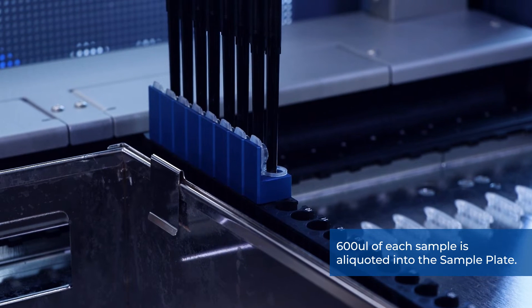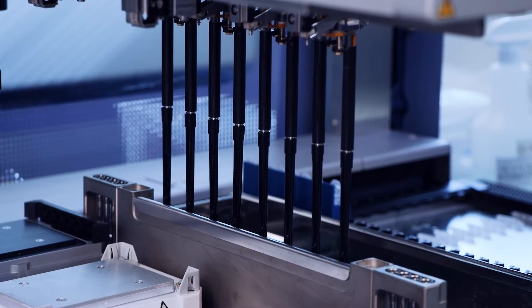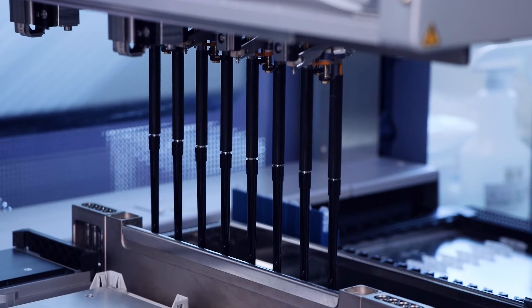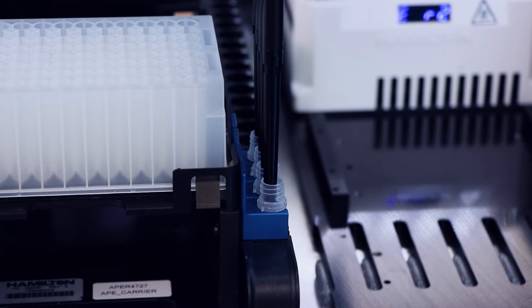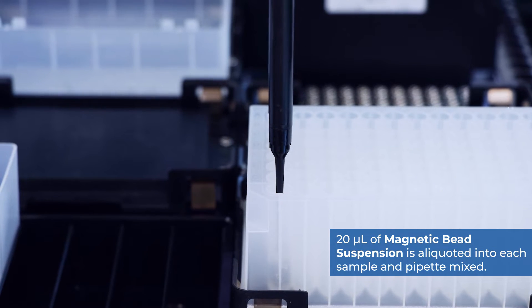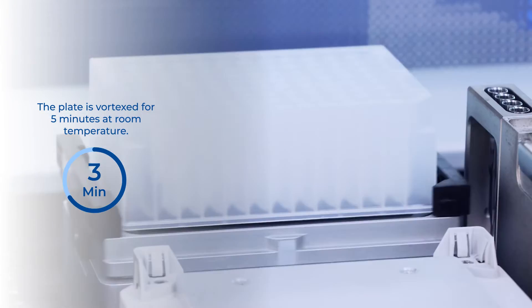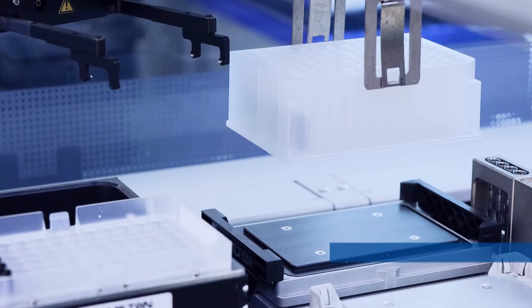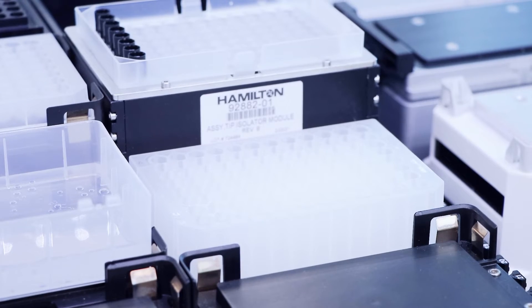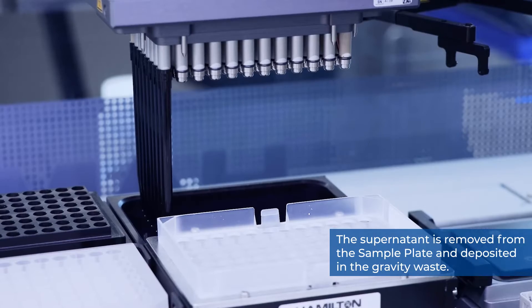600 microliters of each sample is aliquoted into the sample plate. 300 microliters of 96–100% ethanol is added to each sample. The magnetic bead suspension is pre-mixed to ensure homogeneity, and then 20 microliters is aliquoted into each sample and pipette-mixed. The sample plate is transferred to the shaker and vortexed for five minutes at room temperature, then transferred to the magnet for one minute to form a pellet. The supernatant is removed and deposited into the gravity waste.